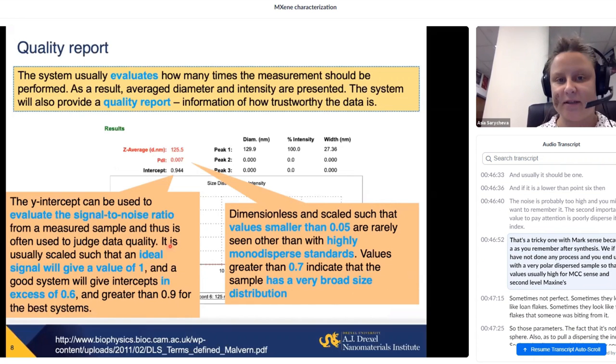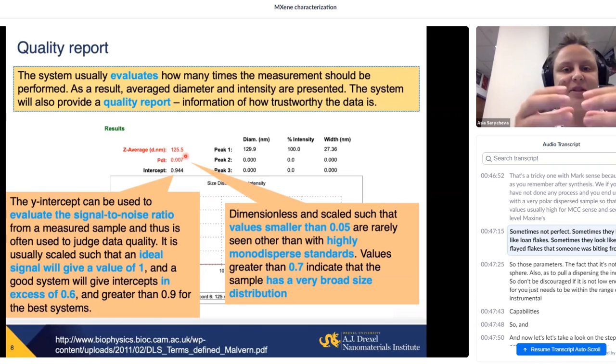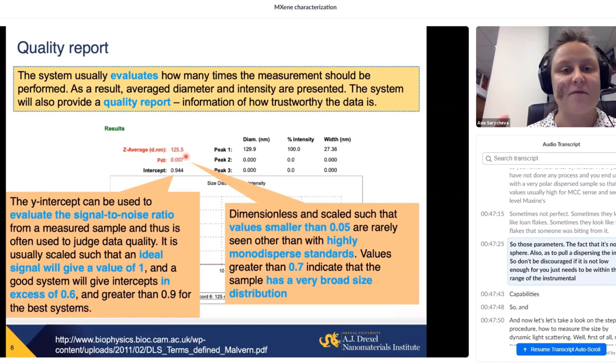That's a tricky one with MXenes because, A, as you remember, after synthesis, if you have not done any processing, you end up with a very polydispersed sample. So that value is usually high for MXenes. And second of all, MXenes are sometimes not perfect. Sometimes they look like lawn flakes. Sometimes they look like flakes that someone was biting from. So those parameters, the fact that it's not a sphere, also adds to polydispersity index. So don't be discouraged if it is not low enough for you. It just needs to be within the range of the instrumental capabilities.